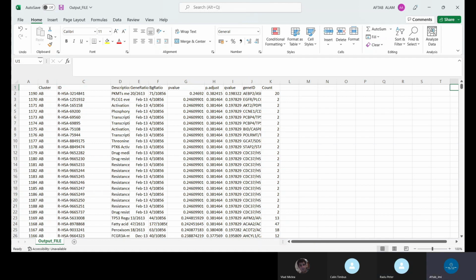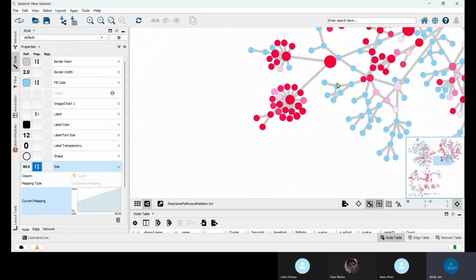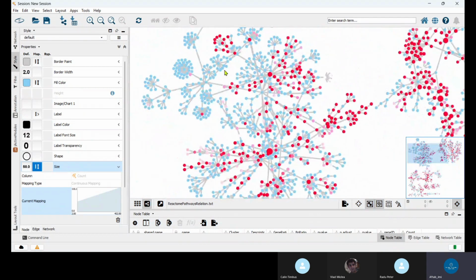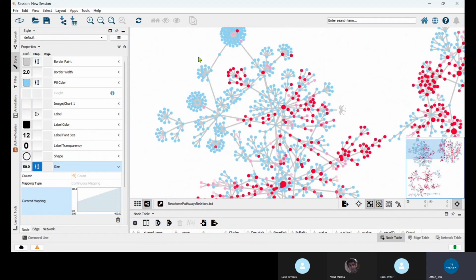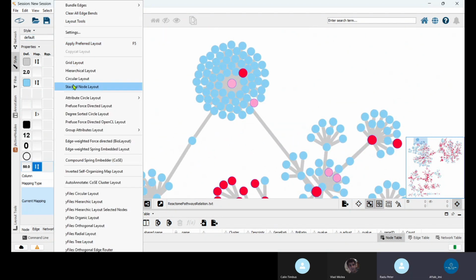These are the basic settings. So now you can save in PDF, EPS, JPG, and any other format. If you want to customize these settings more, you can have many attributes and layouts. You can go and set the layout which looks best. Any layout like this version is available. In the paid version of Cytoscape, there are many good templates for visualization. Here you can use a template, but there is a limited layout.